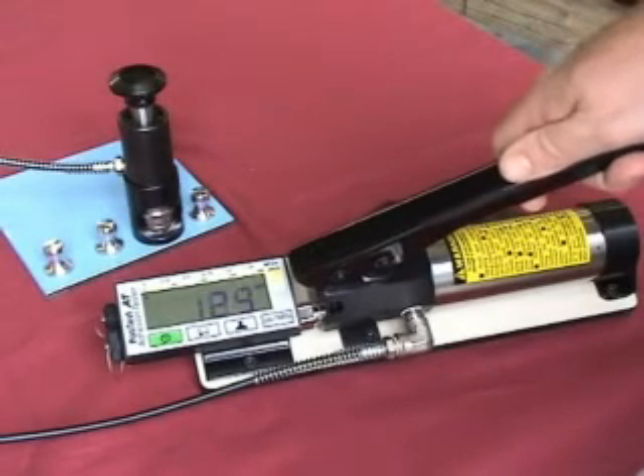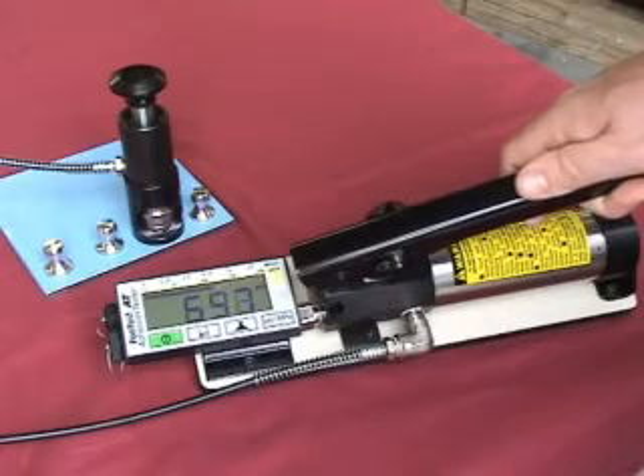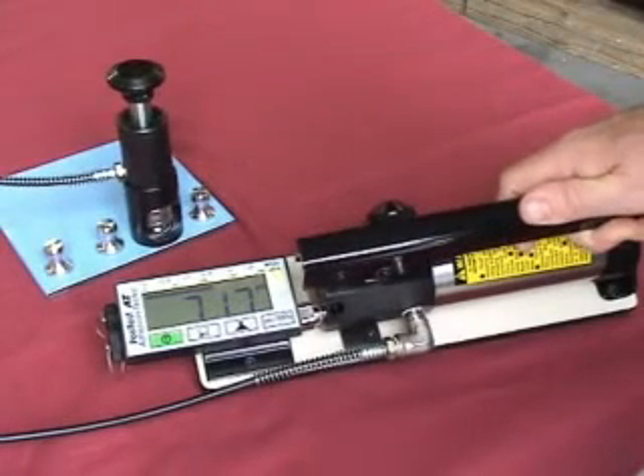This instructional video details critical elements and considerations for the pull-off adhesion testing process. A portable pull-off adhesion tester measures the force required to pull a specified diameter of coating away from its substrate using hydraulic pressure.